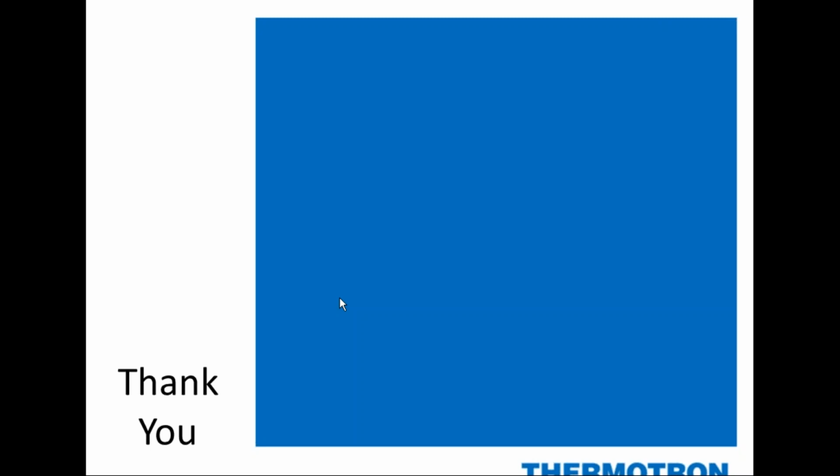Oh, sure. So there's different ways to get rid of humidity out of an enclosed space like a chamber. One is with dehumidification. So we would condense the water out, and then that would drain out of the chamber, causing that closed workspace to be dry.